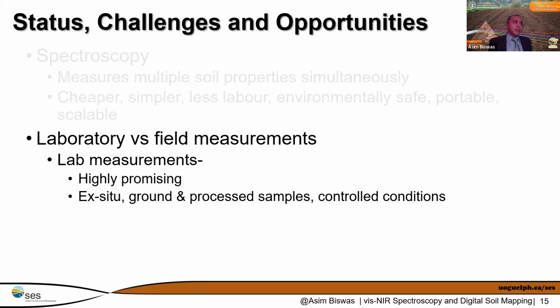But still, we need to go out to the field. We need to collect samples and process them. It requires labor, it requires time and all. The only thing we are actually replacing or leveraging here is, can we replace those chemically associated measurements with more sensor-based measurements in this aspect?